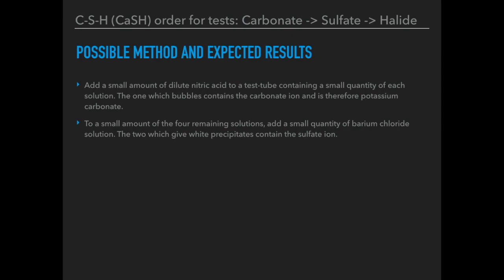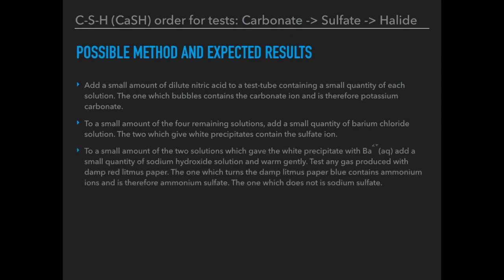To distinguish the two sulphates, we add a small quantity of sodium hydroxide solution to each of the two solutions that gave the white precipitate with barium ions, and warm gently. We then test any gas produced with damp red litmus paper held at the mouth of the test tube. The one which turns the damp litmus paper blue is producing ammonia, confirming the presence of the ammonium ion — so that is ammonium sulphate, and therefore the other one must be sodium sulphate.